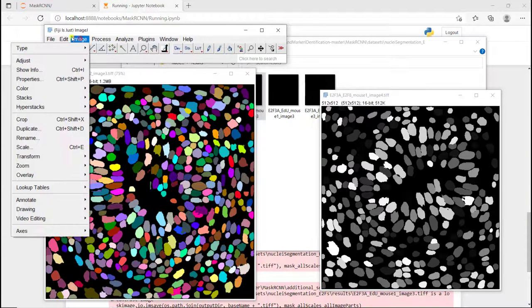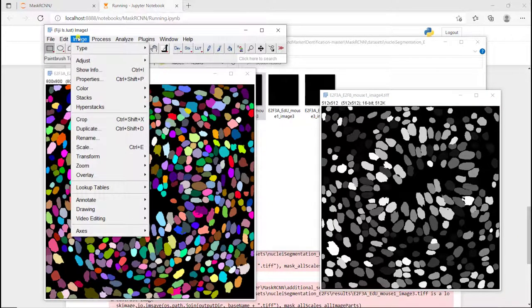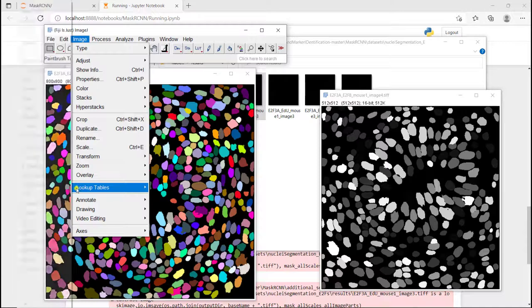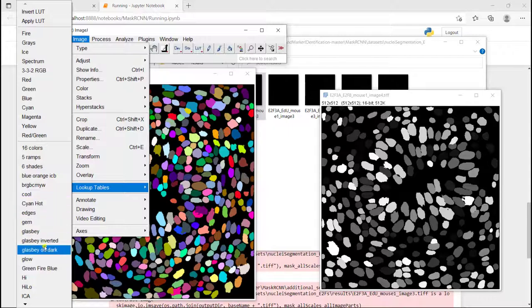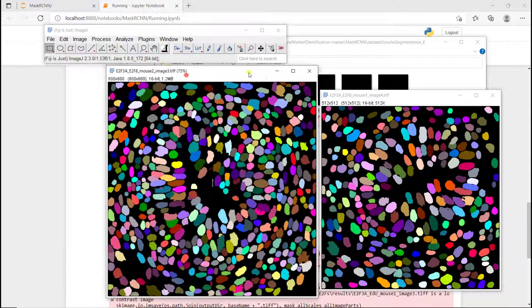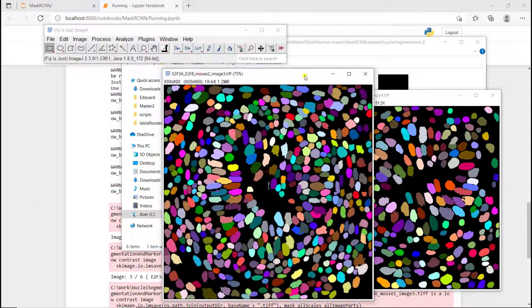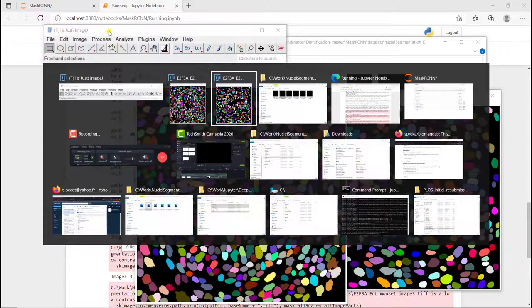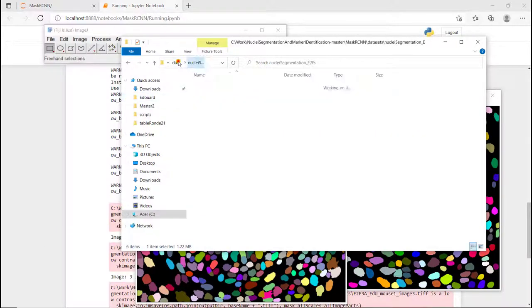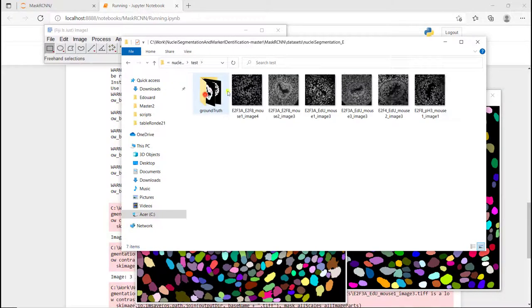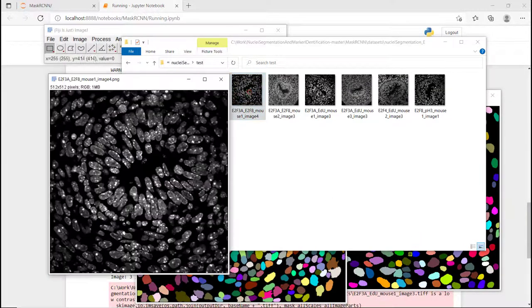Here we see that we missed some areas. If I go back to test, the first one, it's going to be this one. Definitely see that we are missing large chunks here.